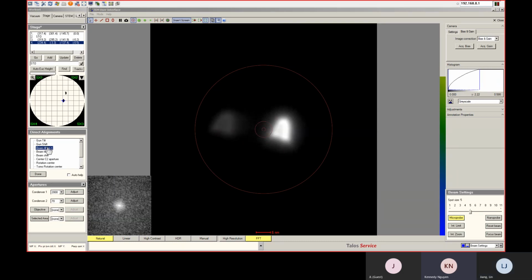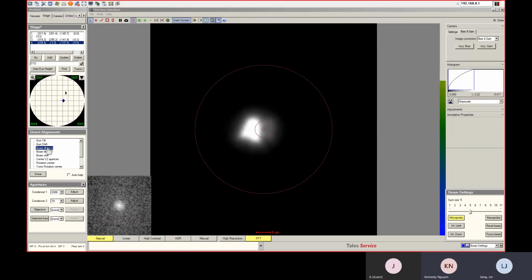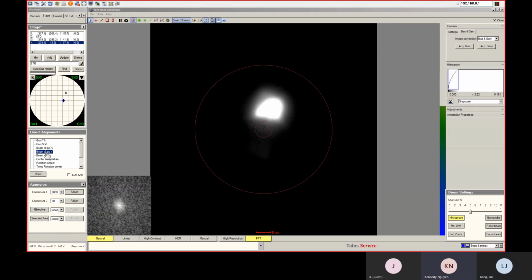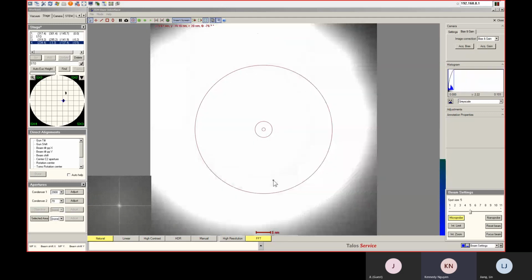Let's put PPX. PPY. All right. Can we go back to the sample? Sure. All right. We'll spread out the beam.